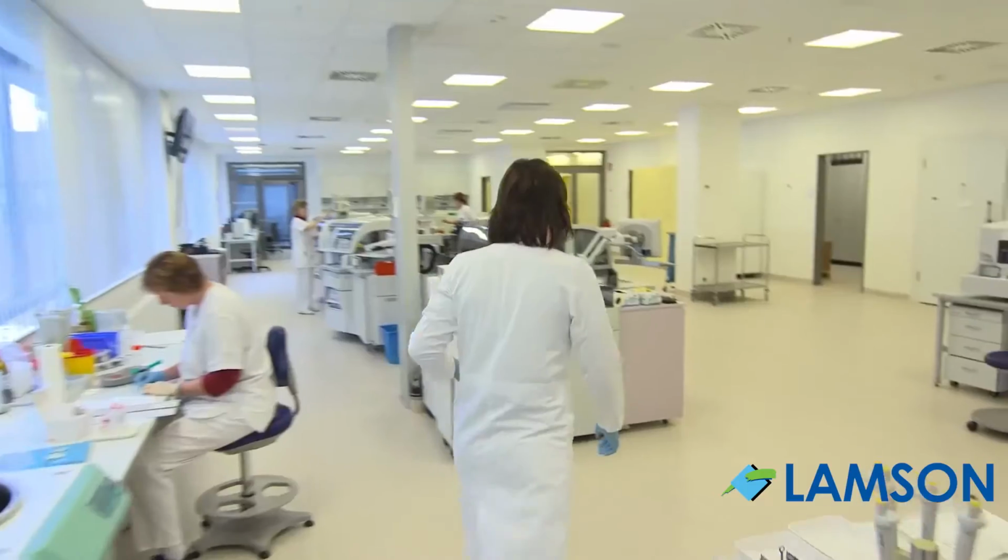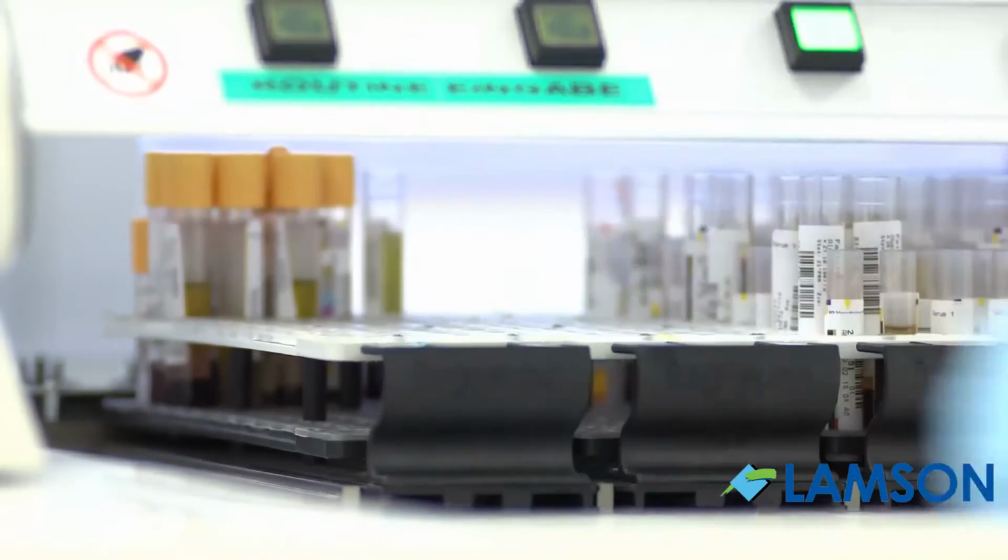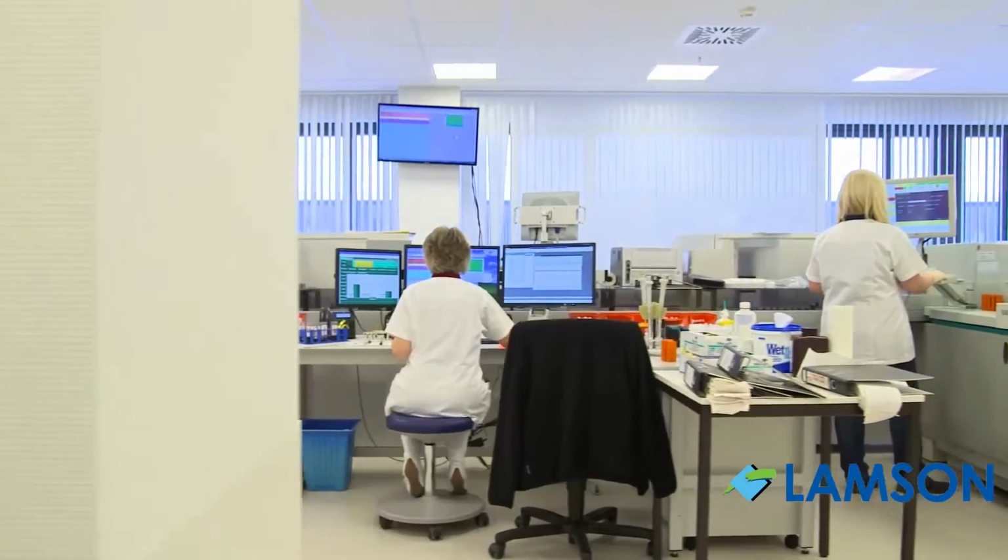These carriers are color-coded, and we can see up front whether there is an emergency in any of them or not. To the senders, this is, of course, the best solution, because the data, the results, are available a lot quicker, and we cannot know each sender's number by heart.